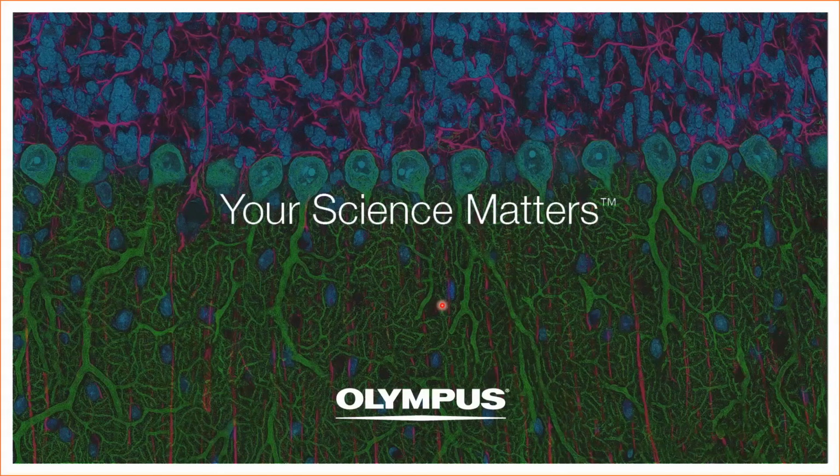Thank you, Tim and Gulpreet, for a lovely presentation. While we have questions coming in, I have some already here for us. The first one's for Tim. How does the X-Clarity system affect the sample quality and structure compared to other clearing methods?